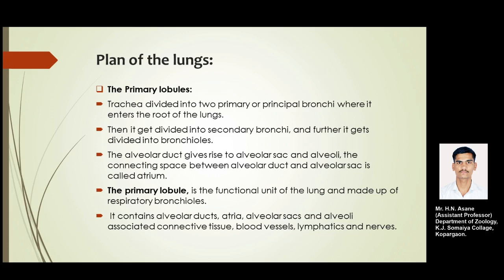Under the light microscope, the respiratory portion of the lung shows large spaces that are separated by the septa of the lobules.